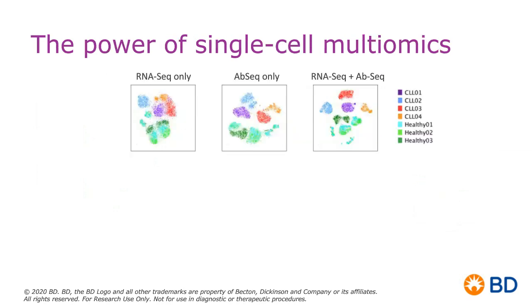I think this slide really shows the power of single-cell multiomics. We've all seen tSNE plots before, and we know they create these interesting little islands. These algorithms take all the information they receive and determine what's similar to other cells. On the far left, this is the same data with our 7 different samples color-coded by individual sample.